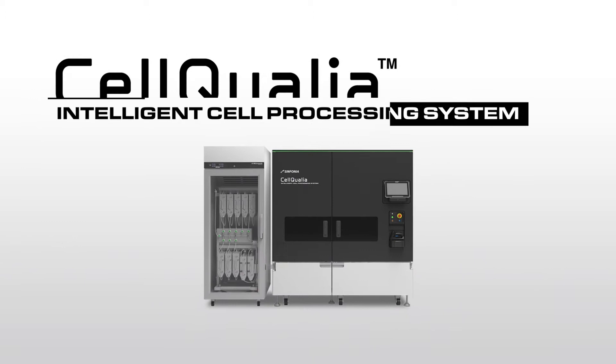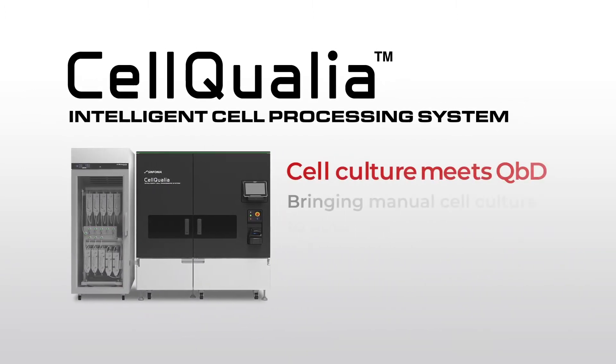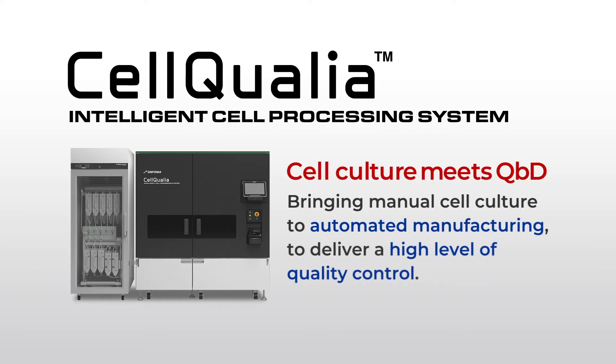CellQualia Intelligent Cell Processing System is the world's first instrument for automated cell manufacturing with process analytical technologies. This instrument brings manual cell culture to automated manufacturing and delivers a high level of quality control.